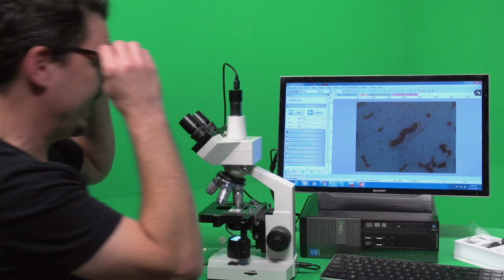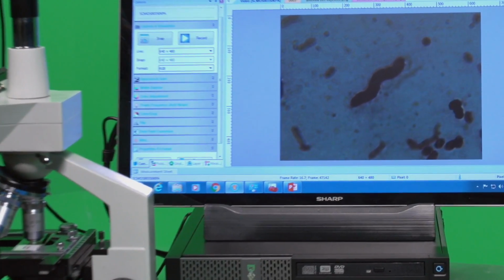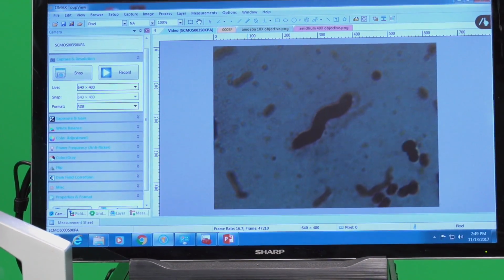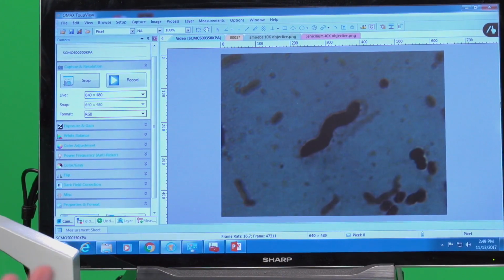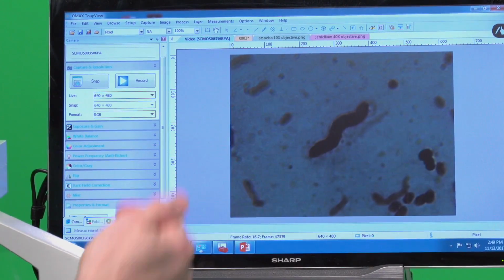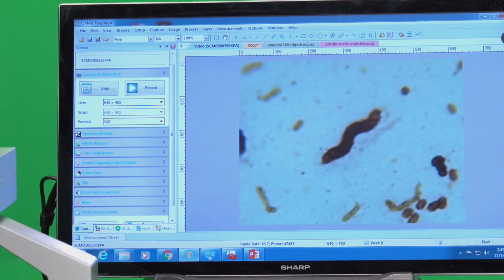So that right there is the image that we would want uploaded into the discussion board, uploaded into the lab report. Now it's a little bit dark background, and it's darker because of the camera that's actually filming us right now, right? So this looks a little bit different, what you're seeing, than I'm seeing it with my own two eyes. The background is actually brighter.